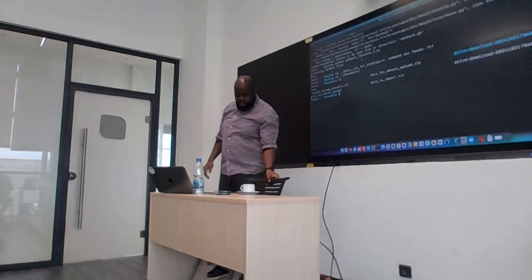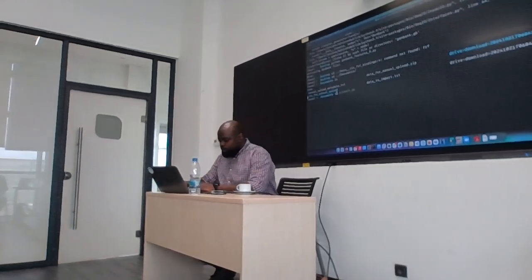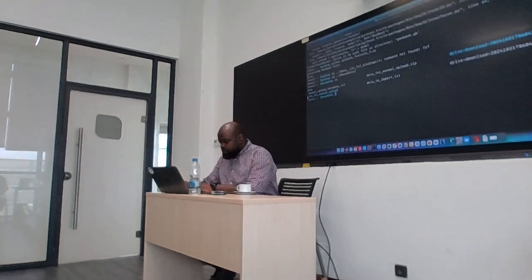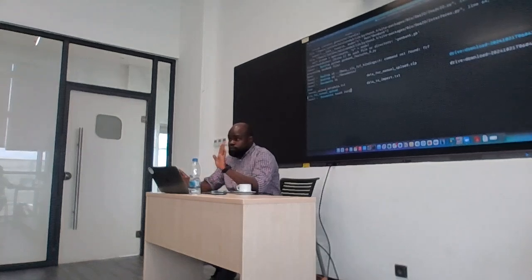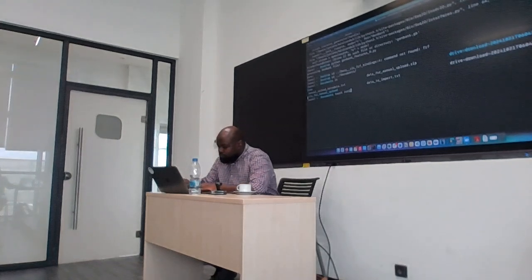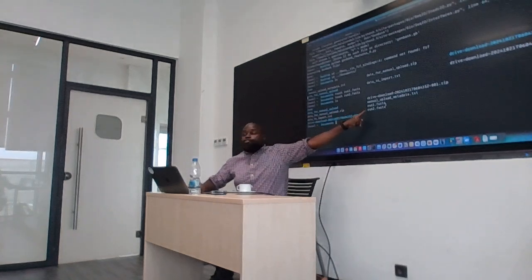Now let's assume that I have two files. So let's say I have two FASTA files, run 1 and run 2, right?